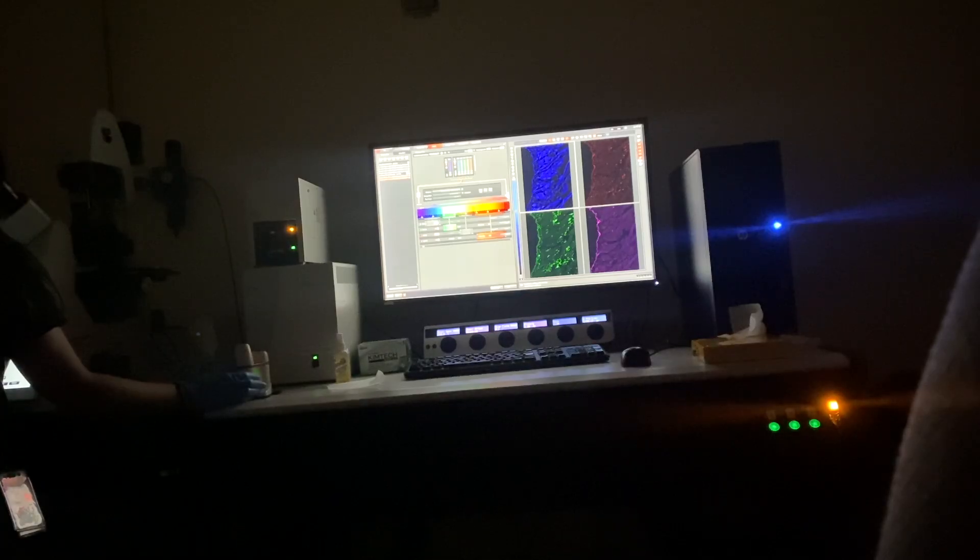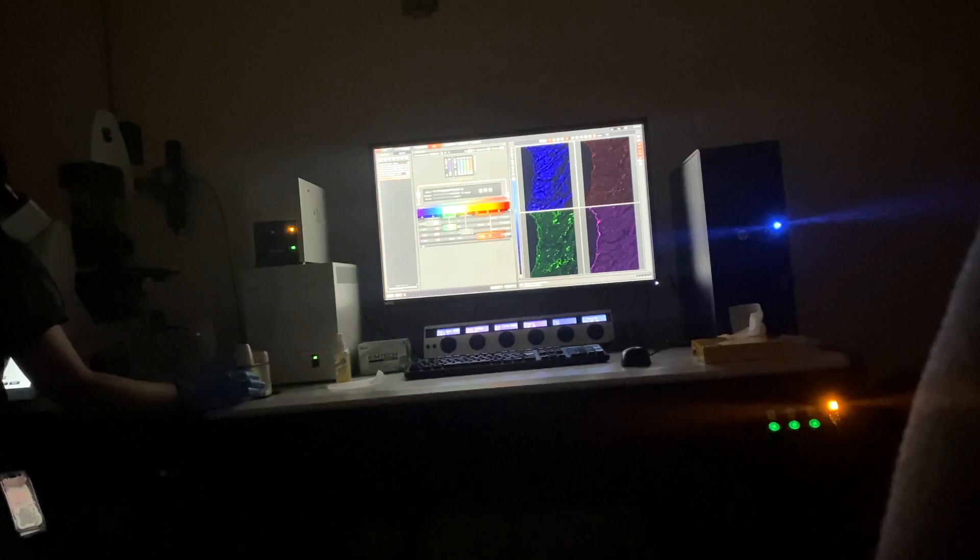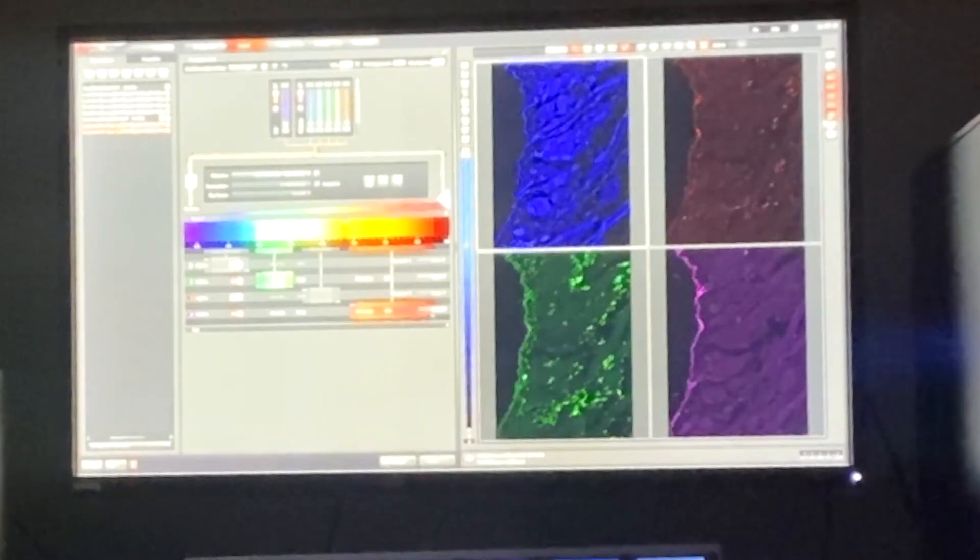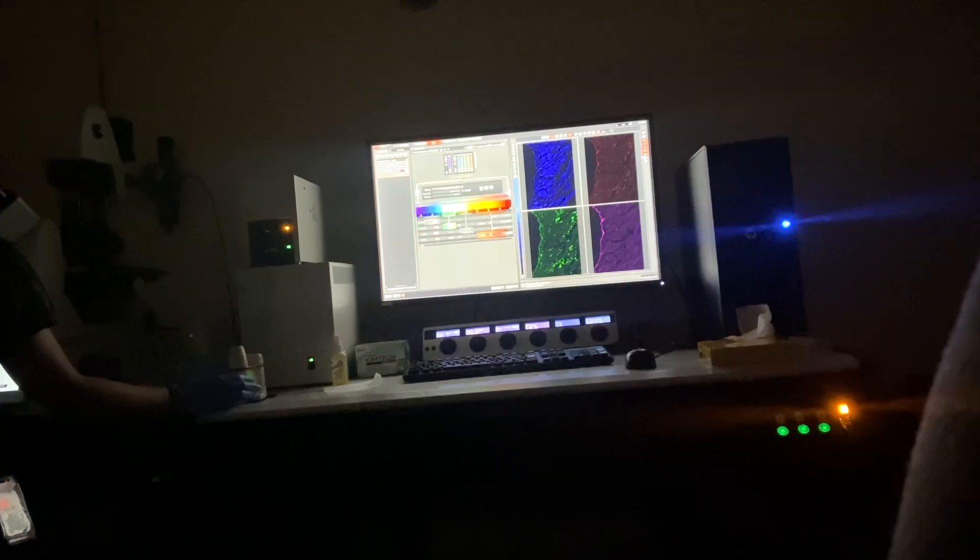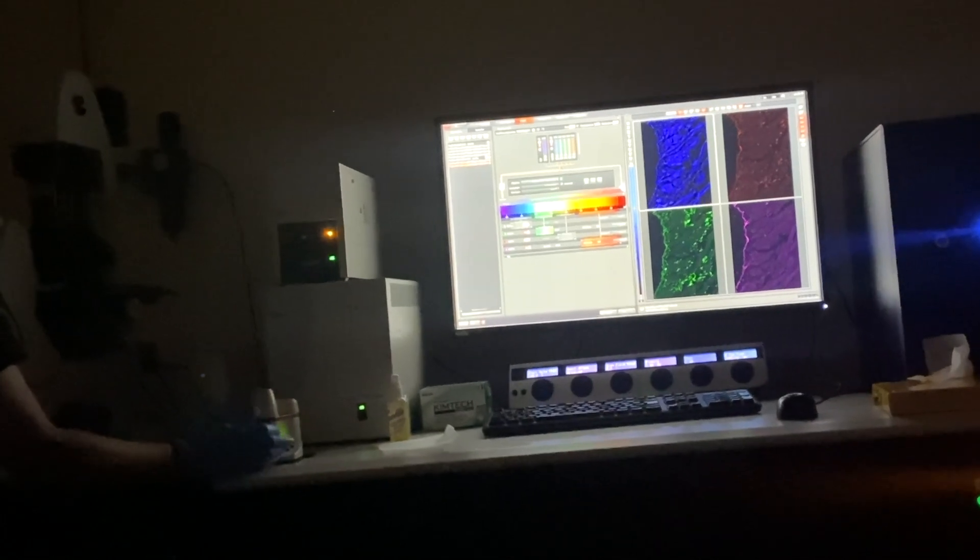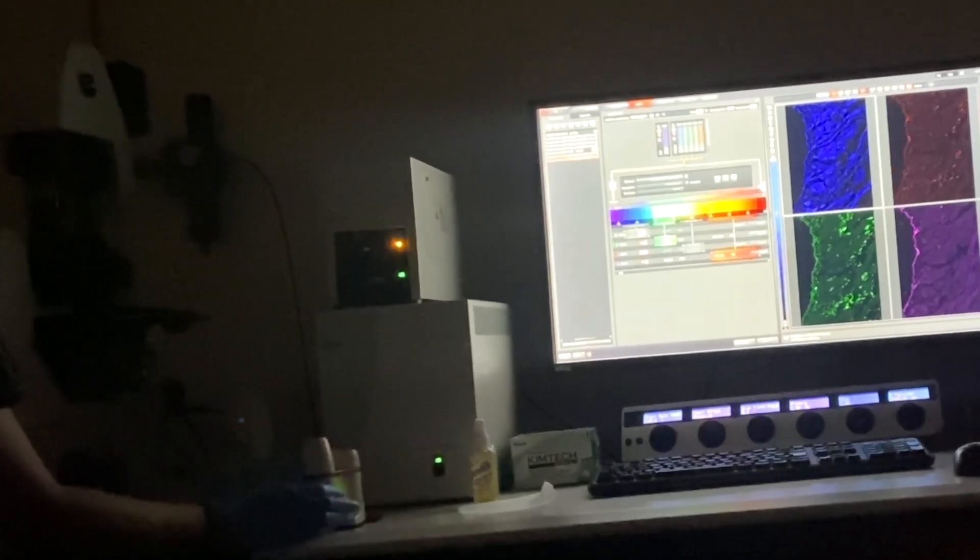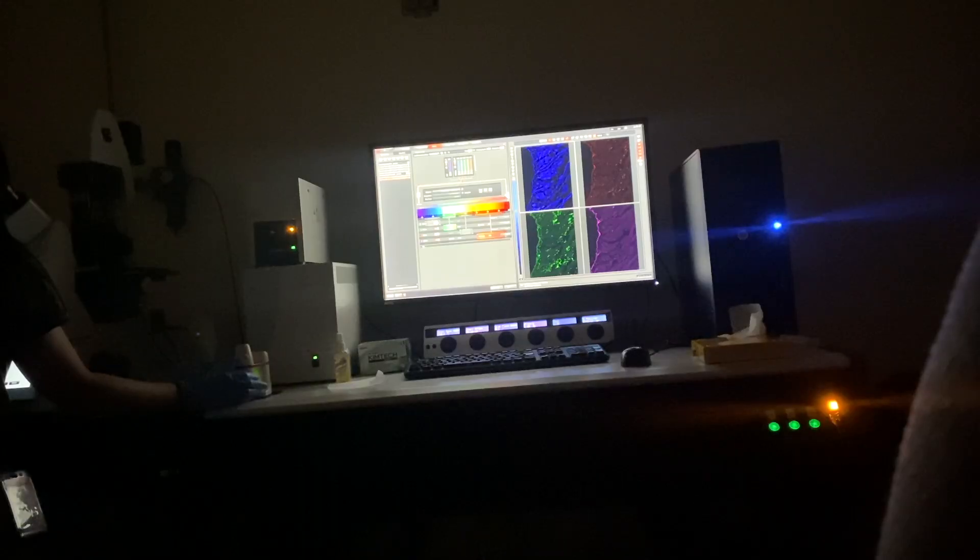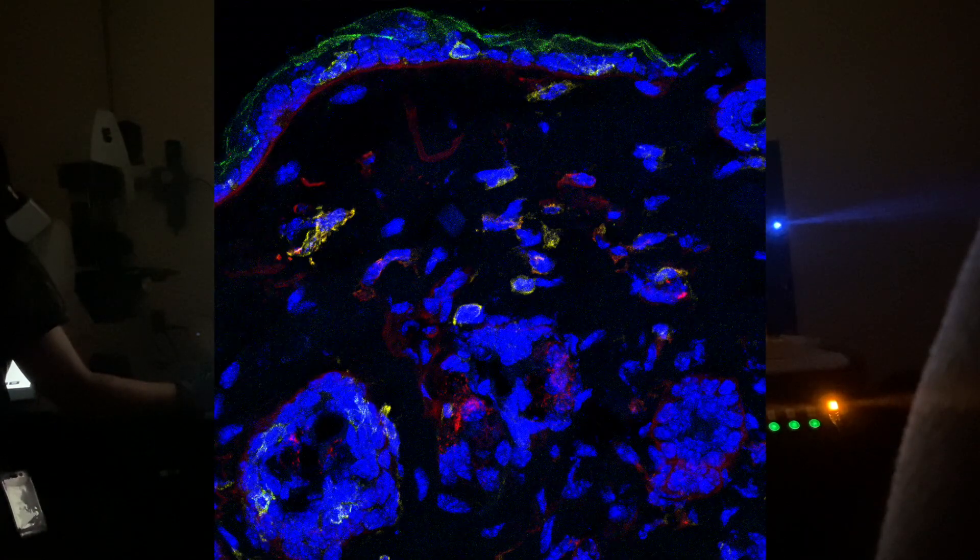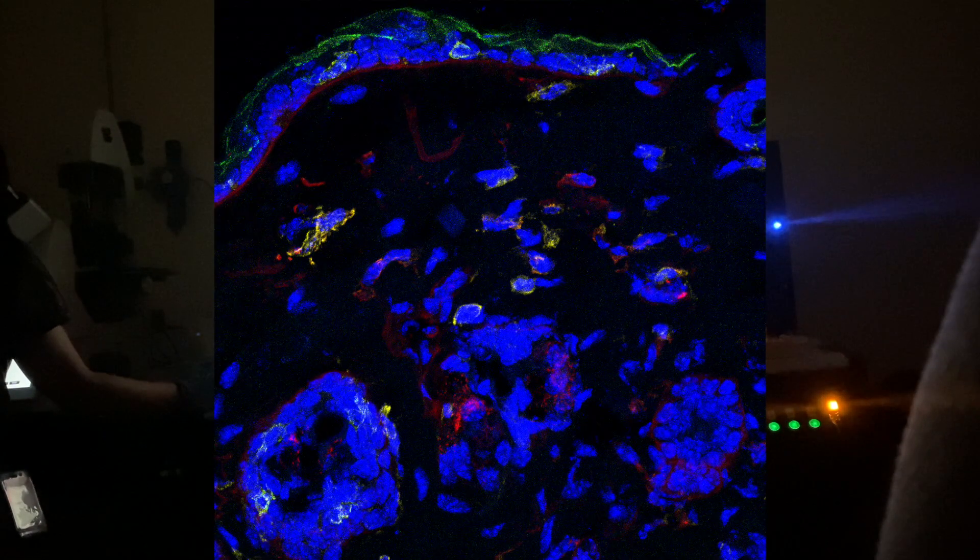So I'm using a confocal microscope, a type of microscope that allows you to take images of things in specific planes of view or depth levels, even through the inside layers of the specimen. And this could be done at a high resolution. So really clear, zoomed in images.